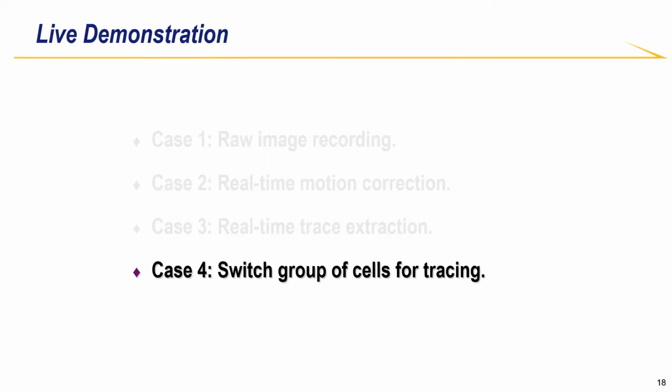In order to demonstrate that our real-time trace extraction can support a maximum of 1024 cells, in the last case we show trace extraction for a selectable group of cells.